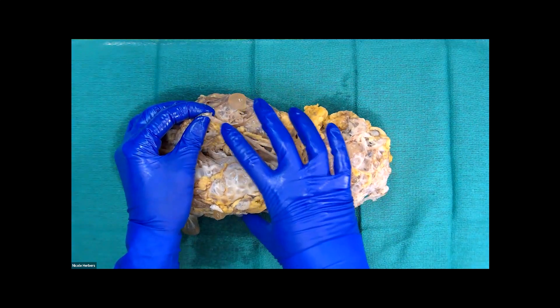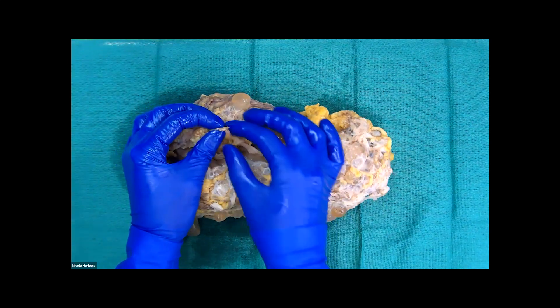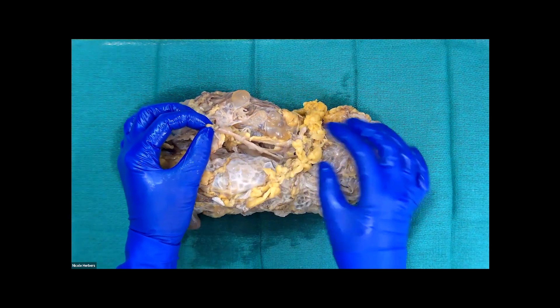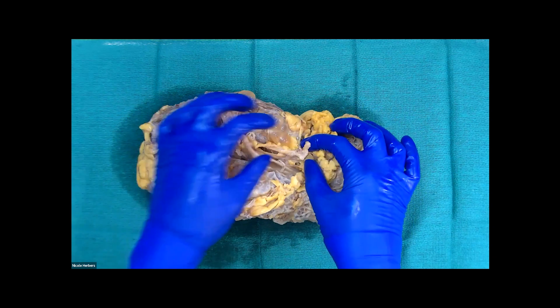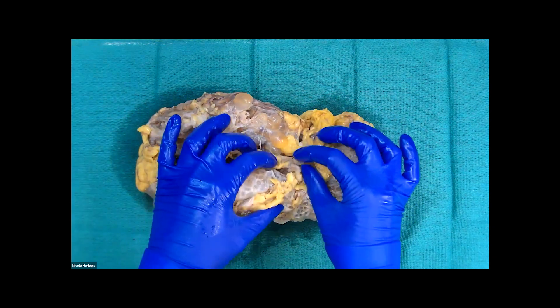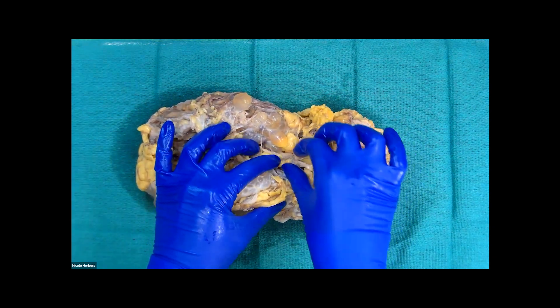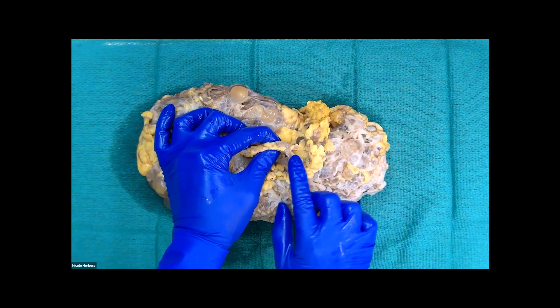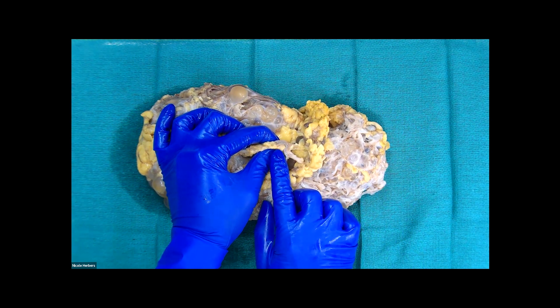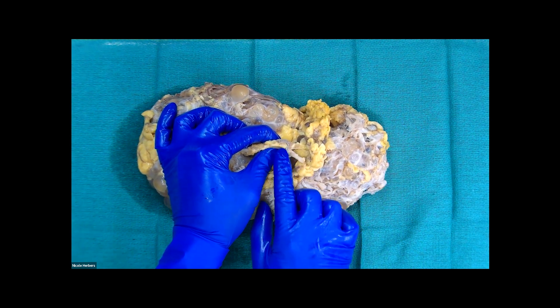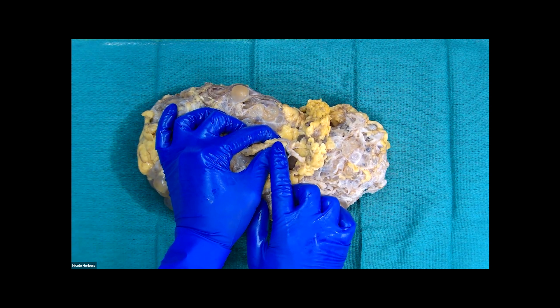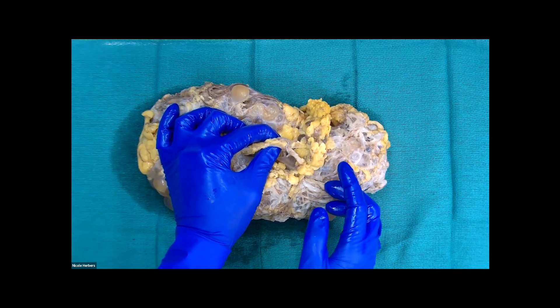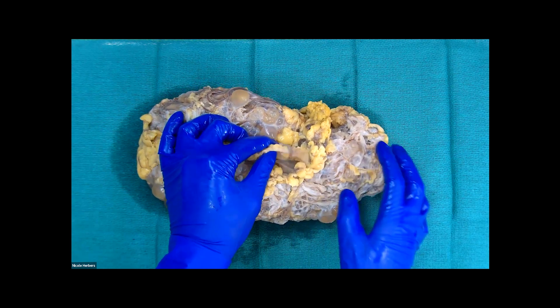For our specimen here, this is our ureter. Most of the time, our surgeons will put a staple clip at the end of the ureter. Our vascular margins are usually stapled with a staple line. I'd cut off this staple line to look at the lumen and assess which one is the renal vein versus the renal artery.